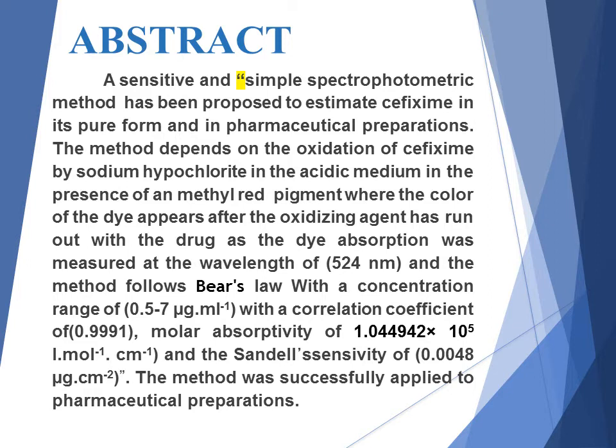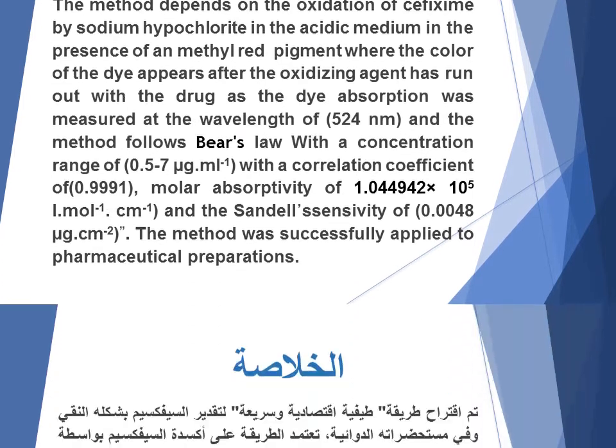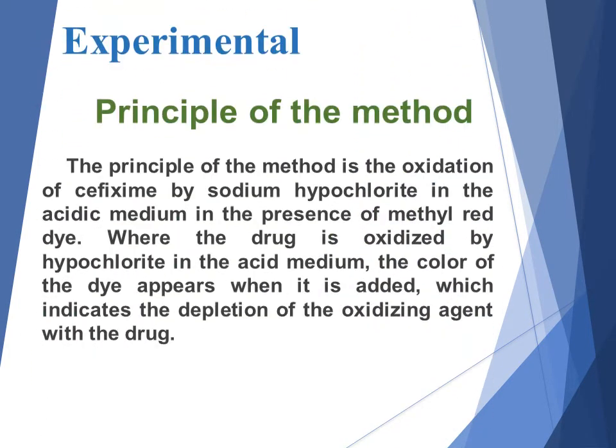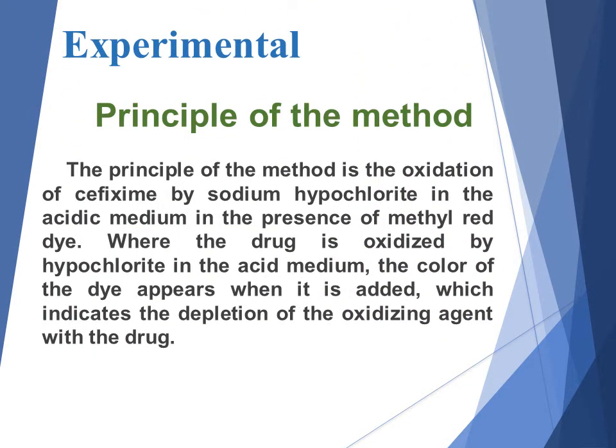524 nanometer, and the method follows Beer's law with concentration range of 0.5 to 7 microgram per ml, with correlation coefficient and molar absorptivity as shown in the slide. The method was successfully applied to the pharmaceutical preparation. Experimental principle of the method.